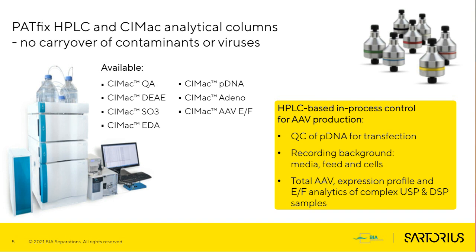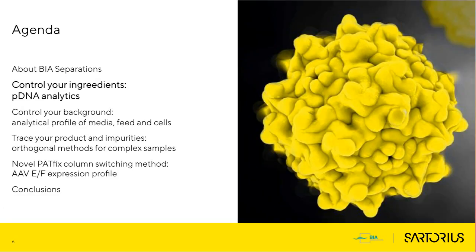We will be using columns of different chemistries, which you can see available on this slide. So let's get started. The first topic to cover is pDNA analytics. When you are setting up your upstream process development, you are early in your AAV production.